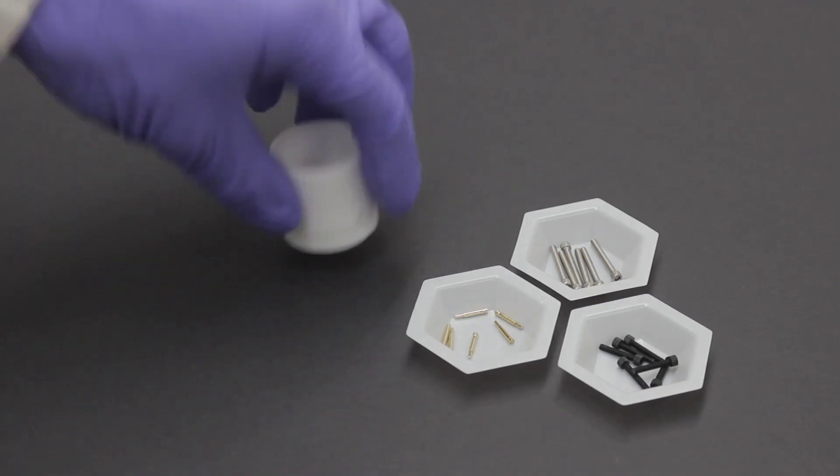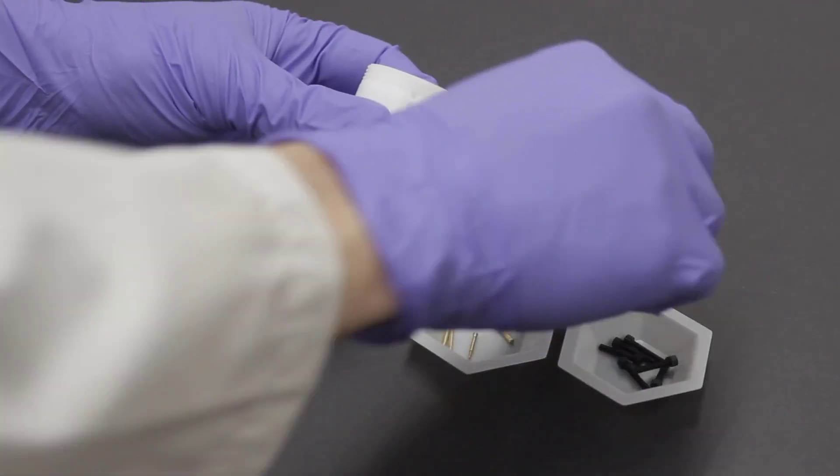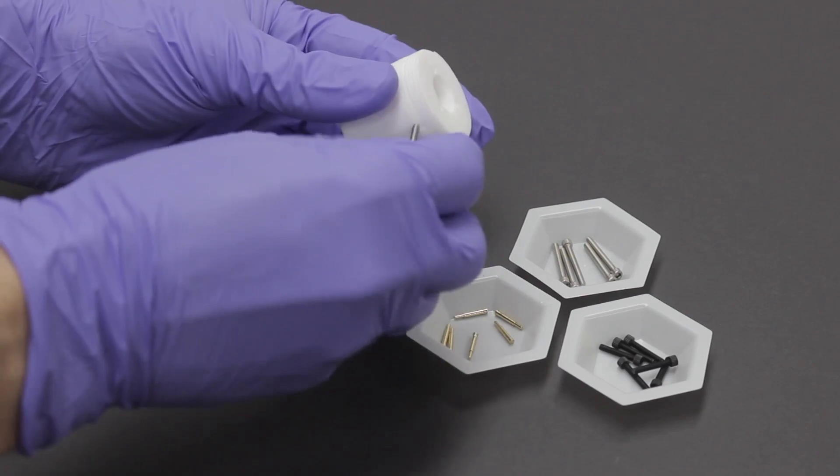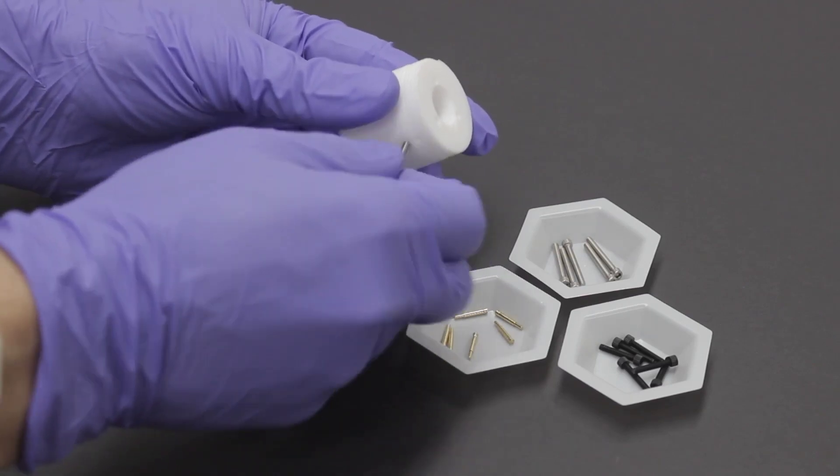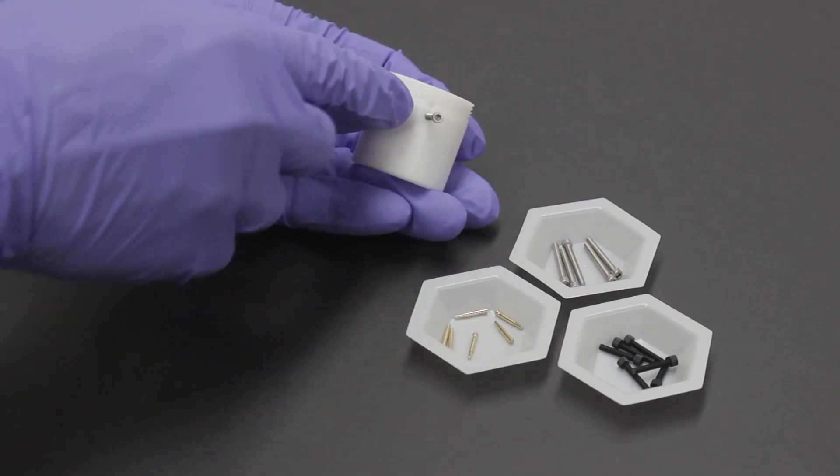Take the cell base and hold it upside down so that the external threads are facing up. Next, install a stainless steel contact screw into one of the holes furthest from the threads.